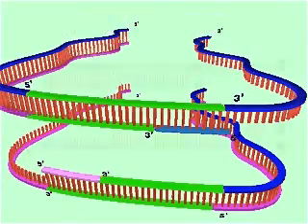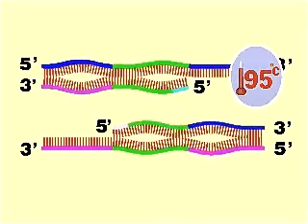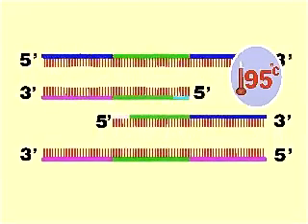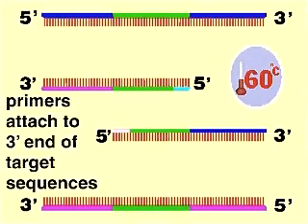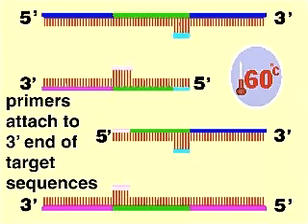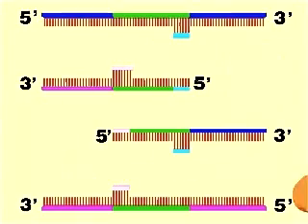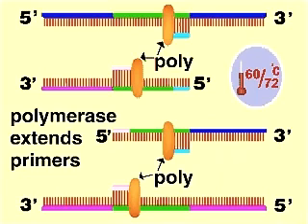In the next cycle, the same steps are repeated. DNA duplexes are again melted by heating to 95 degrees. Since Taq polymerase has the special property of being thermostable, it is not inactivated at this high temperature. The primers anneal to the target when the temperature is lowered, and the target strands are extended by the Taq polymerase. The temperature can be raised to 72 degrees to speed this reaction.